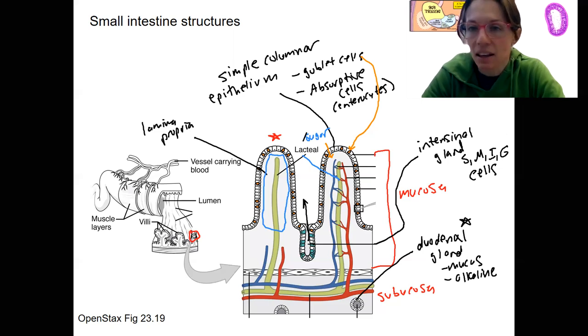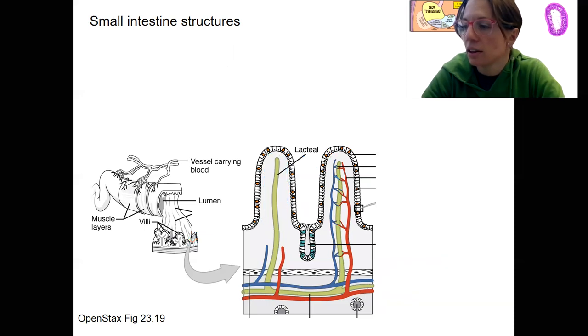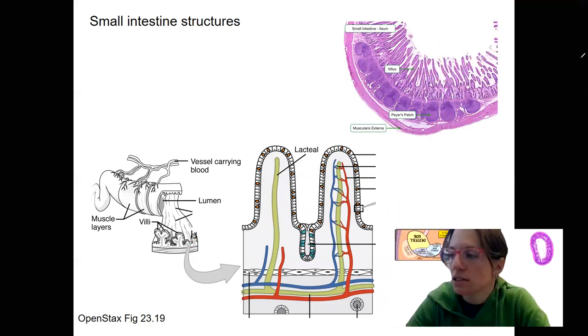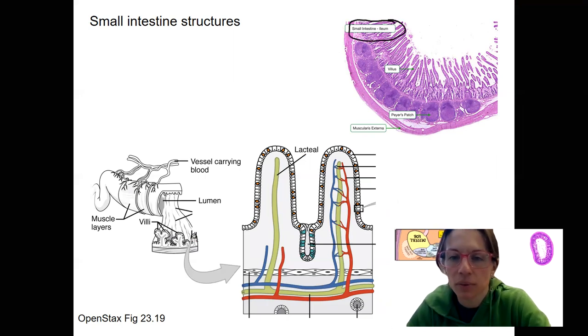The last thing I want to show you on this slide is Peyer's patches. These are typically further down from the duodenum. So this would be ileum. Here we go. More distal ileum. So toward the end of the small intestine. And these are Peyer's patches, which are lymphatic tissue.